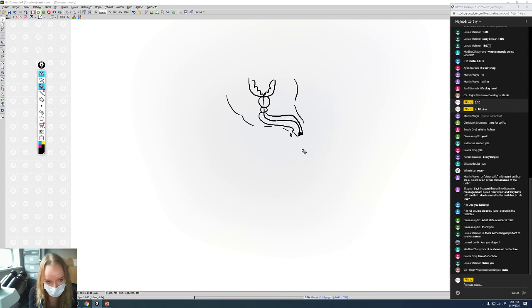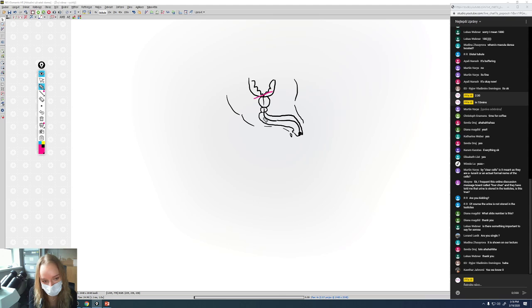Okay. And we already had a section through the urinary bladder. Yeah, we had the section, and we're going to have a section through the penis. And there are some parts of the penis, like the spongiosa part or the urethra, which is going through the corpus spongiosum, like in here.